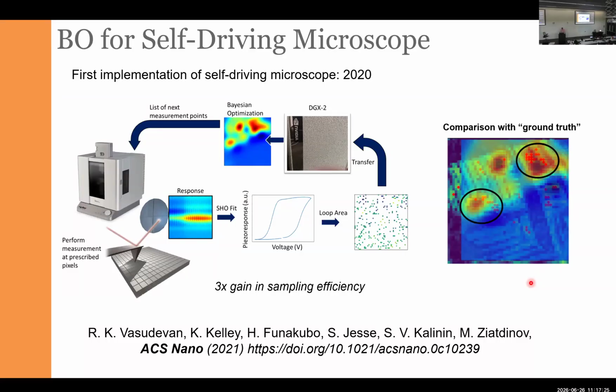So practical experience that my group had over the last 8 years, first in Oak Ridge and then at UT, was that if you want to build something like this, always start with investing time and effort into the digital twin or the pre-acquired data set that allows you to prototype these models before going to the real instrument.